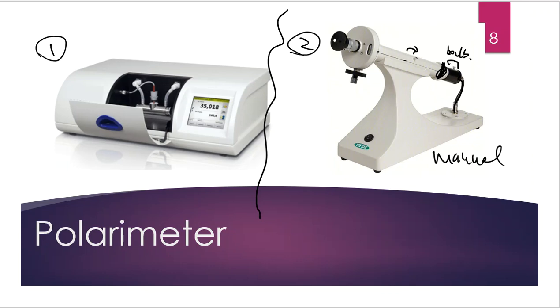I need it completely dark because I need you to use some common sense. If outside light was escaping inside of this polarimeter, then the whole thing just doesn't make any sense, does it? We used a polarizing lens to get one direction, and if we don't close this thing up, then what are we doing? Either way, I'm going to close the lid and make sure it's fully closed.